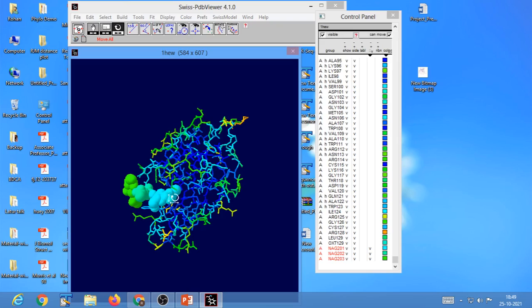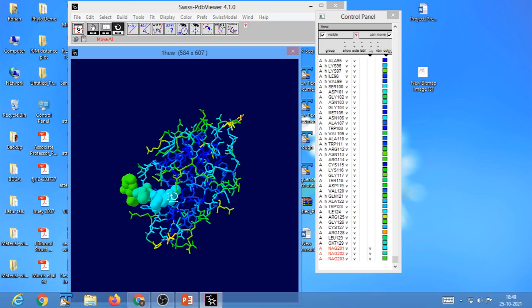Accessibility, right? Therefore, it is colored towards the shade of blue, and green is present toward the shade of red in the visible spectrum. So in this way, you can easily locate what residues are solvent accessible and what residues are solvent inaccessible.